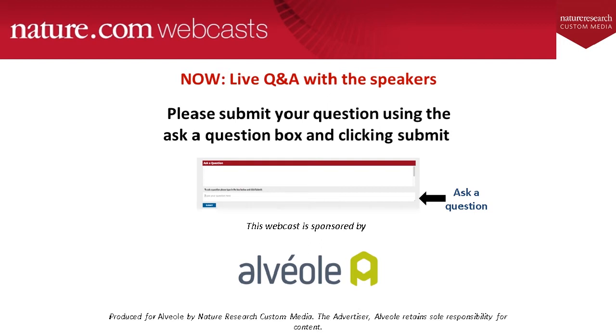Excellent. Thanks, Leeya. Our next question asks, from slide 8, it looks like both PRIMO systems used in this project are kept outside of a tissue culture hood. How do you maintain sterility of the grids that are micropatterned using maskless photopatterning? Yeah, so this is especially important if you're working with a more finicky cell type, of course, or if you're trying to perform a longer cell culture.